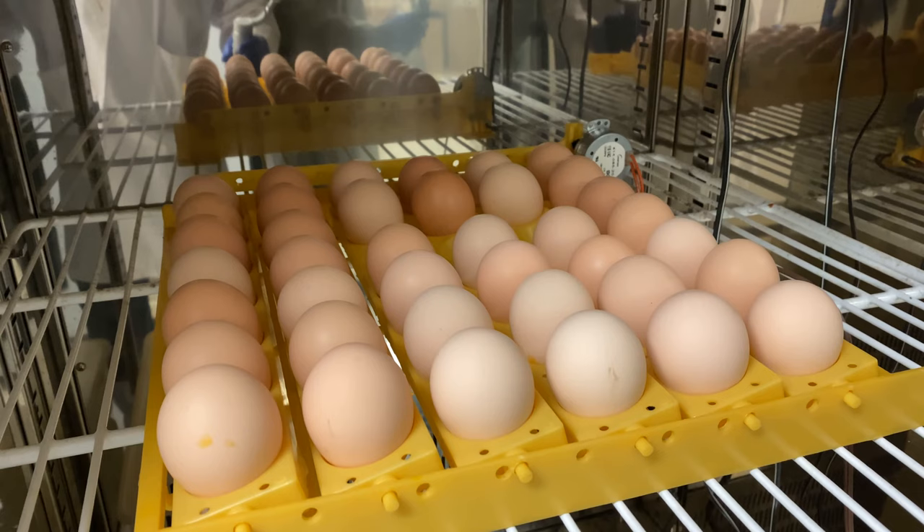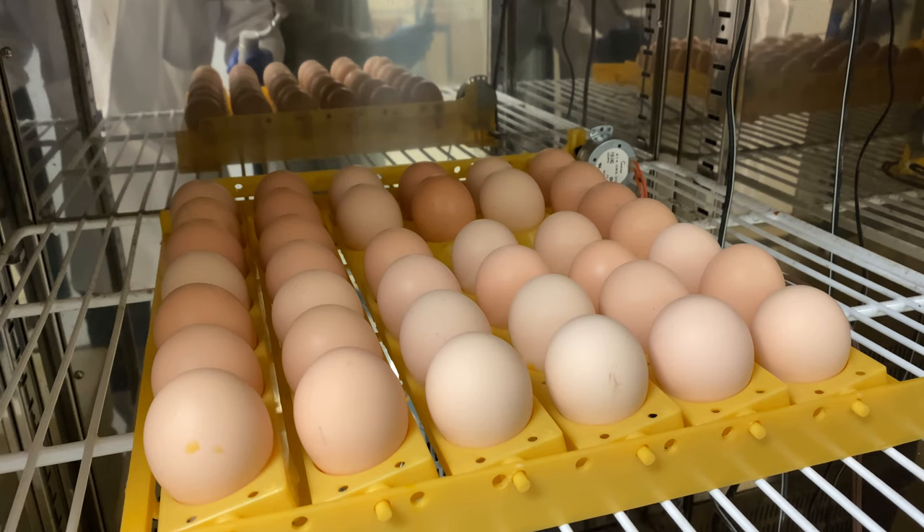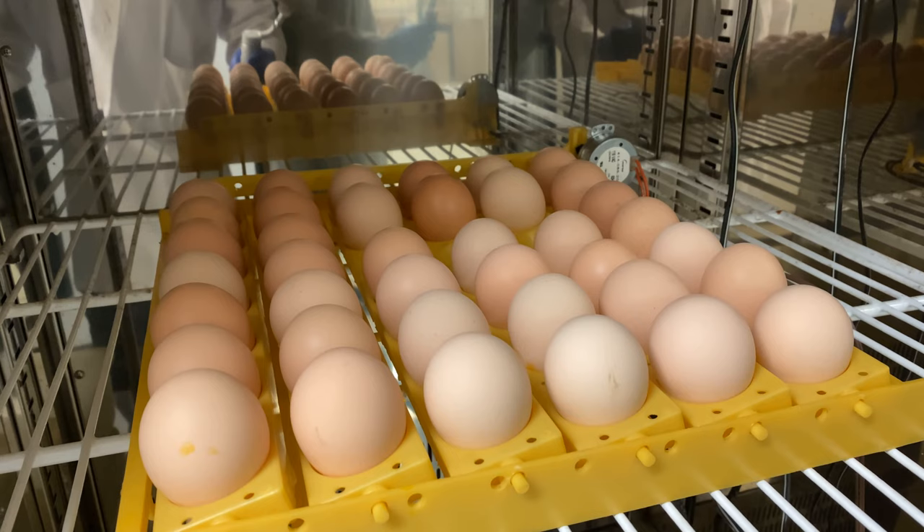Here you can see a number of fertilized eggs we have in our 37-degree incubator. It takes three weeks from fertilization to eggs hatching with a live chicken. We'll be using these eggs at about two weeks time. We want the embryos to be large enough that we can obtain organs, but not so large that they have feathers.